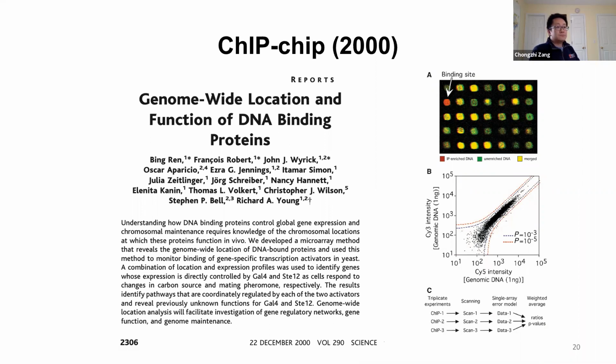So with the development of microarray technologies, which Stefan mentioned in a few lectures before, a technology where they build up a lot of small oligonucleotides, or small probes, on a very small chip, so that these probes can interact with target DNA sequences and recognize whether your sample has a specific sequence or not.